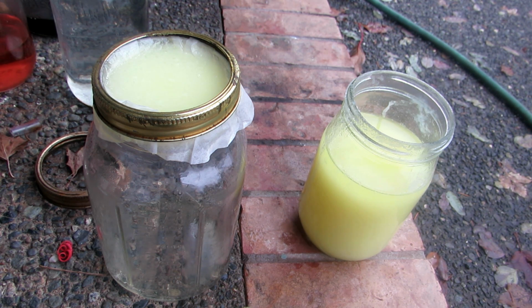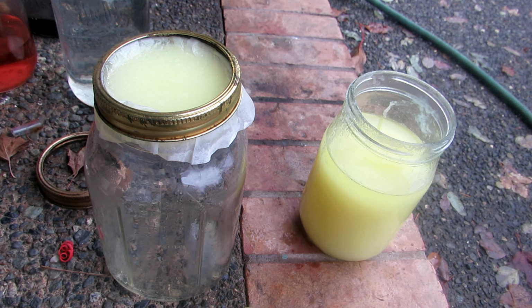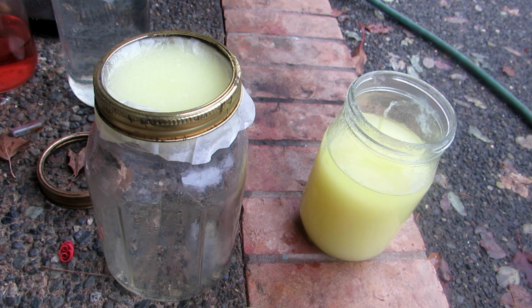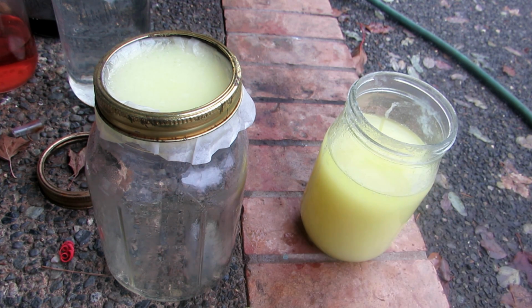If you don't have a vacuum filtration apparatus, I do recommend boiling down your solution of sodium silicate before you add the hydrochloric acid, so that it's less liquid that you have to filter off. Anyhow, as expected, this was a fairly exothermic reaction, so it is quite hot, so it is a good idea to let the solution cool down from the previous step.